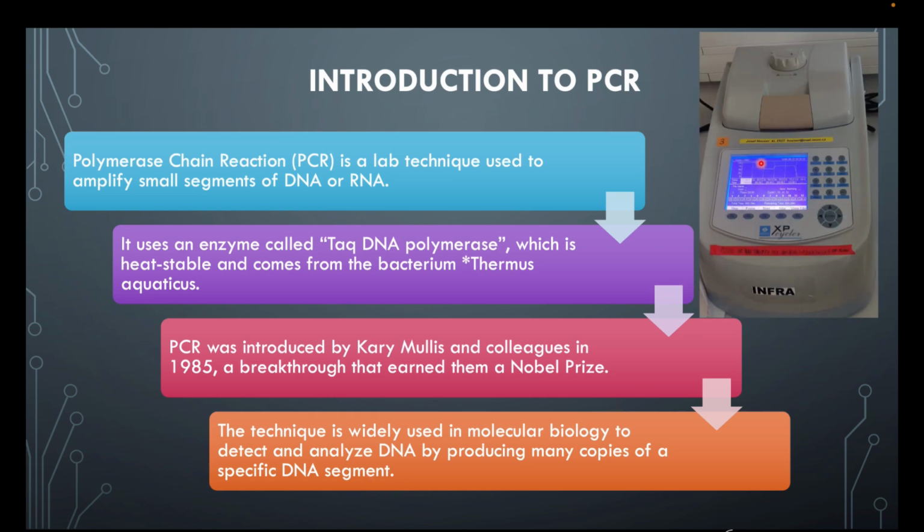So this is a thermocycler in my lab where I used to perform the experiments for my cloning experiments, and you can see here is the screen where, I will explain in a different slide, there is this graph. You can fix the number of cycles, etc. And this is the lid, and you put it up and place your sample inside this.